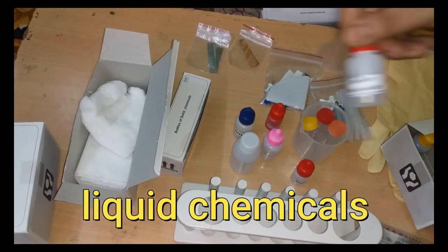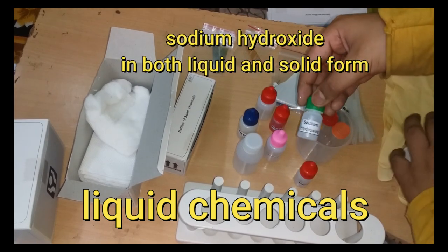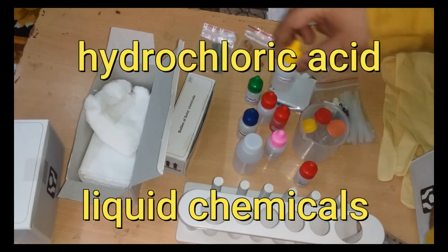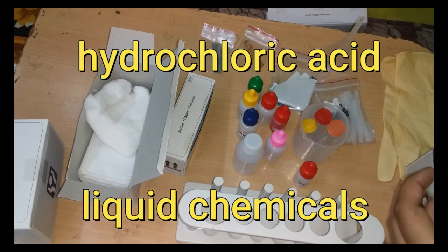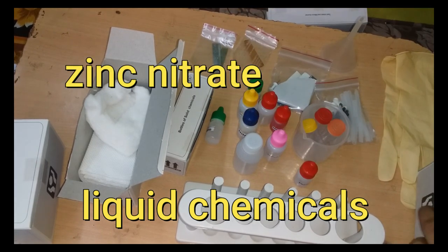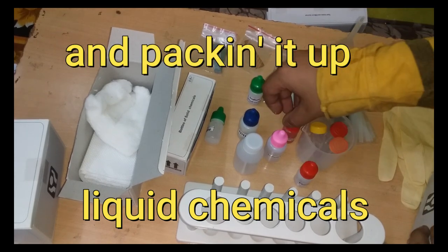You see, now it is sodium hydroxide. It comes in liquid bottles but it has both liquid and solid form. Hydrochloric acid. This is silver nitrate liquid form, crystal form. Pack it up.